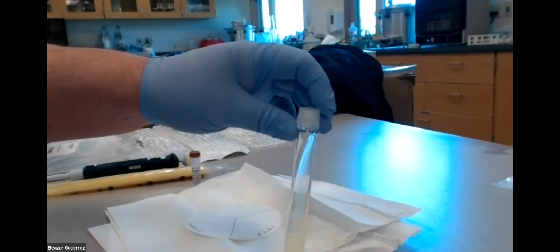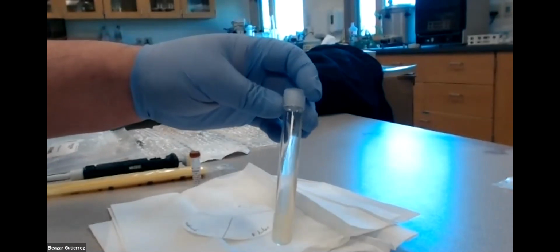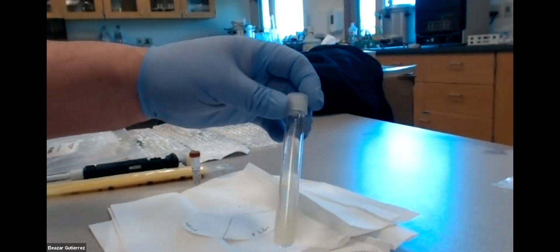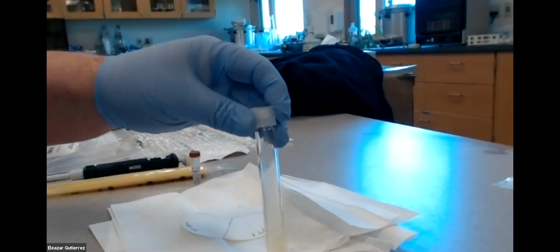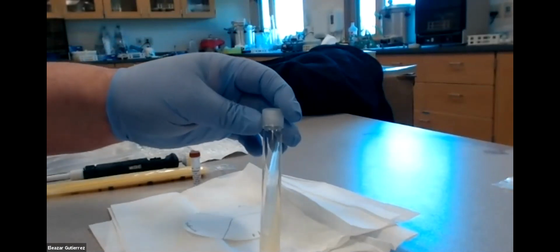I suggest people put it in a sandwich bag, a Ziploc that is impermeable, and then put it above their television set, believe it or not. The area above your television set is sometimes actually too hot, so you might need to put a thermometer in there and make sure that it doesn't get too hot.